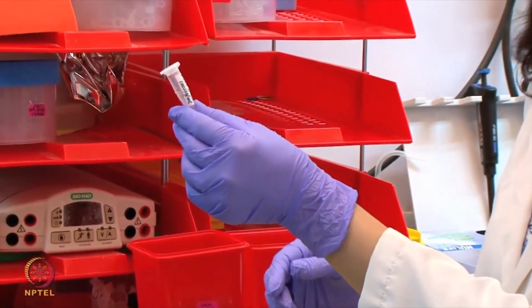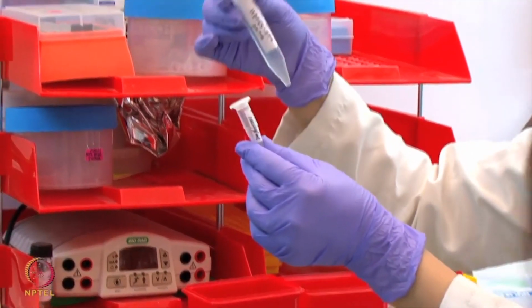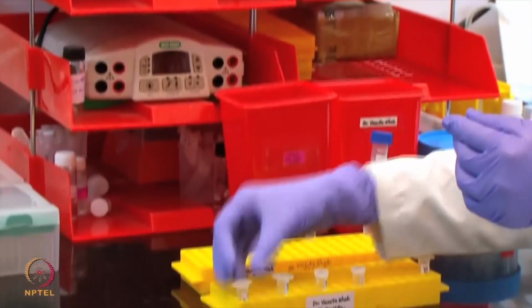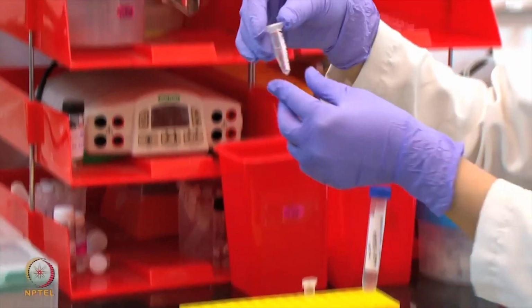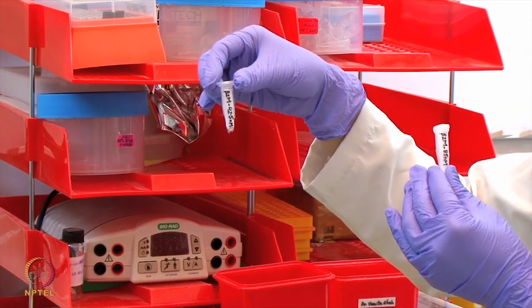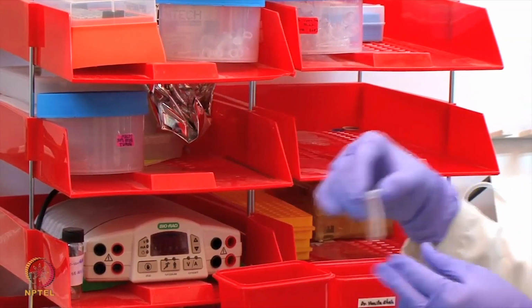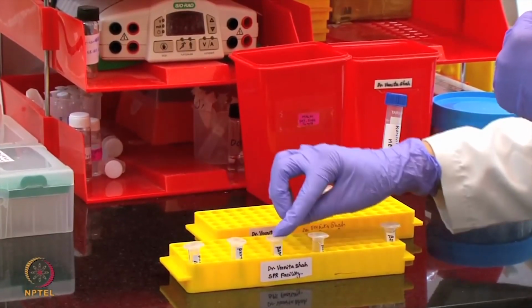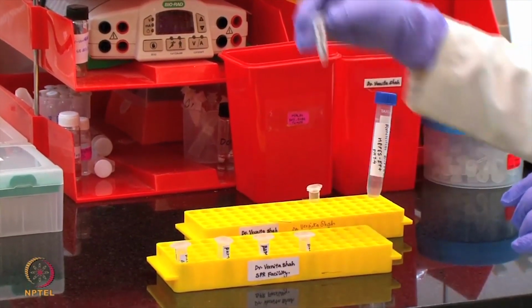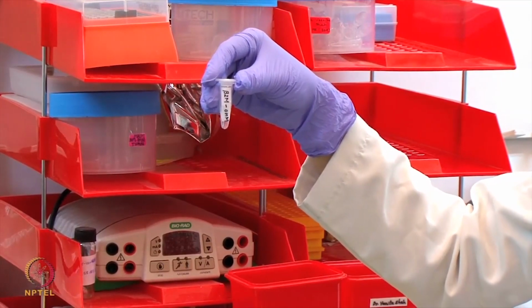We will dilute the stock solution of protein, that is 100 microgram per ml, in the running buffer HBS-EP Plus to prepare 100 microliter of 3 different concentrations, that is 85 nanomolar, 42.5 nanomolar and 8.5 nanomolar, which are referred to as high, medium and low concentrations in the experiment. We will also include 0 nanomolar concentration in the experiment, which will be nothing but the running buffer.